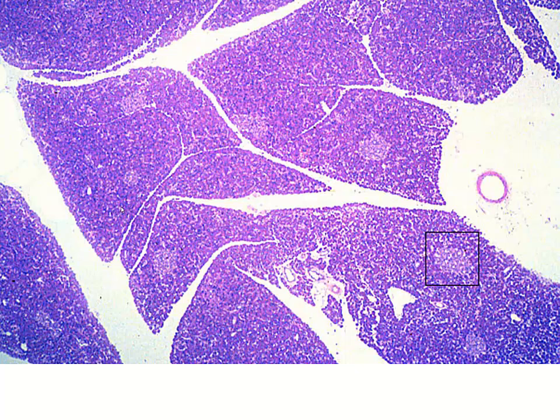Now, we didn't talk about this in our endocrine lecture, but I want you to appreciate that when you're looking at a tissue, and again, at first glance, it's really difficult to tell an organization. You see a lot of dots, and so you might at first think lymphoid tissue, but it's not organized as such. You may think thymus, but again, we don't see Hassall's corpuscles. We don't see a cortex and medulla. But then your eyes are drawn to these areas of light staining patches. These are our pancreatic islets. That's going to be the key that we're looking at pancreas, and these are our pancreatic islets, or islets of Langerhans.